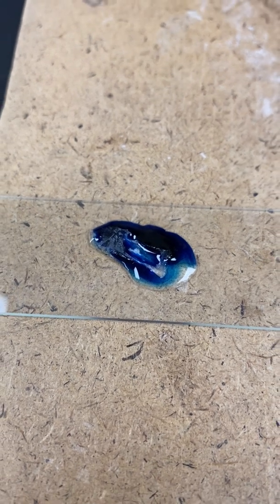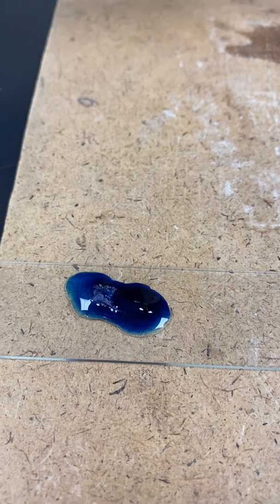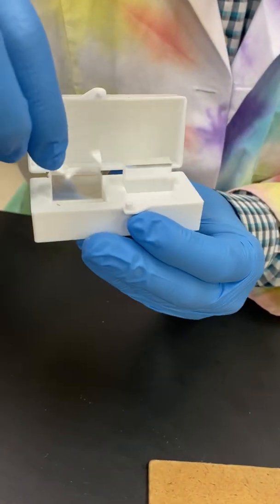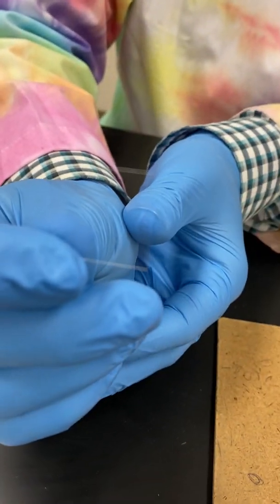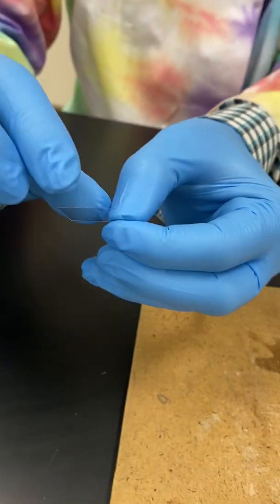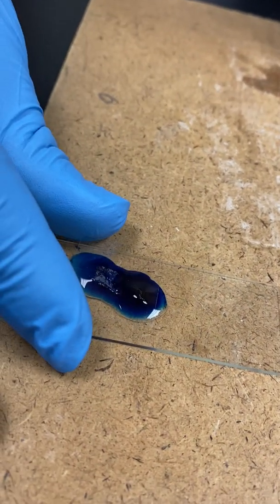Let's add another drop of water to make sure it gets on top, and another one for this little end over here. Now I'm going to add a cover slip, which is a very thin square of glass. Going to kind of tilt it from one side so that as it lays down, it squeezes out all the bubbles.